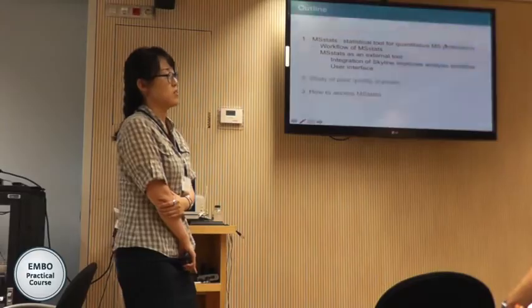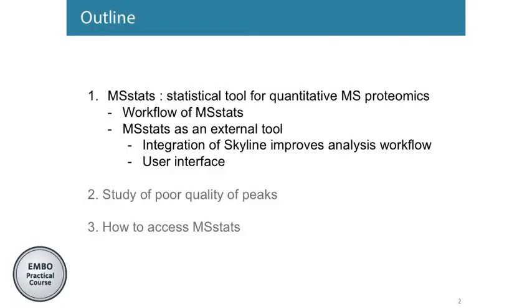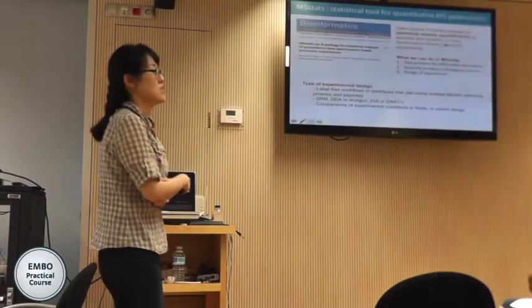with introducing MSstats first. So first I will introduce MSstats, and then second, what you need to consider for the right use of MSstats, and then how you can get MSstats. We have multiple sources to use MSstats, as an external tool or as an R package itself. So I will introduce how you access this. So first, start with MSstats.